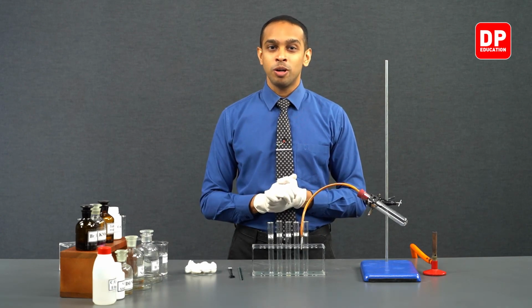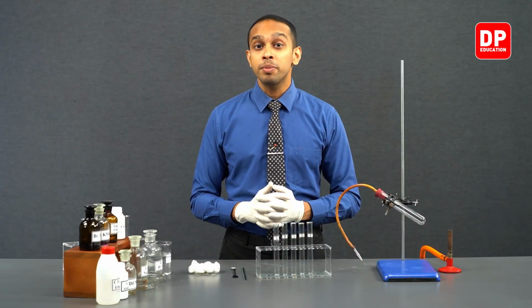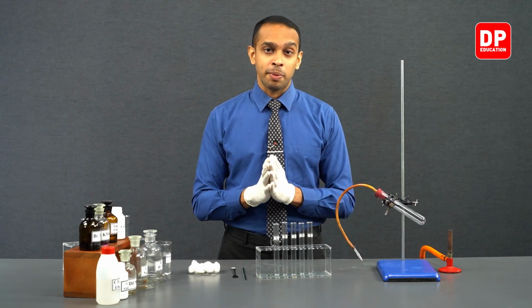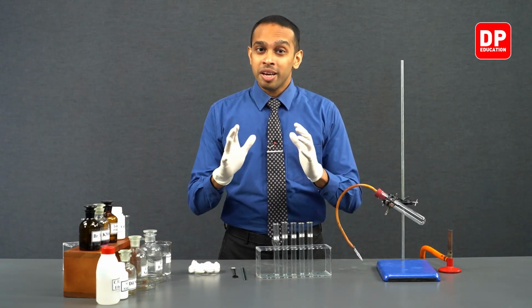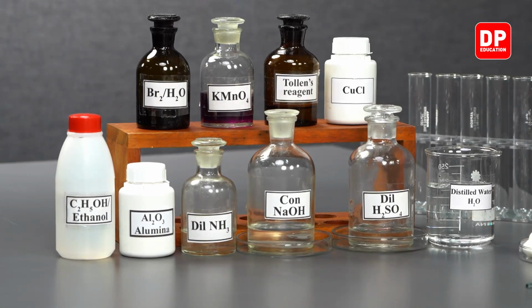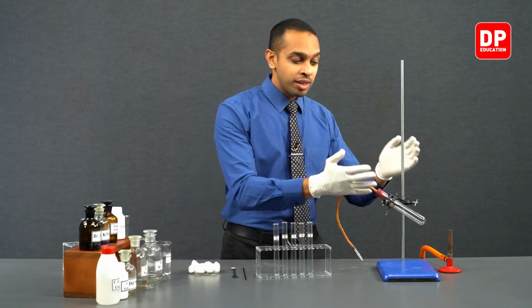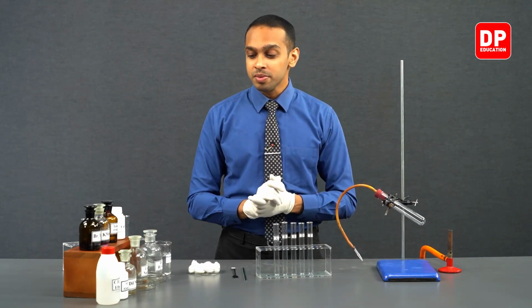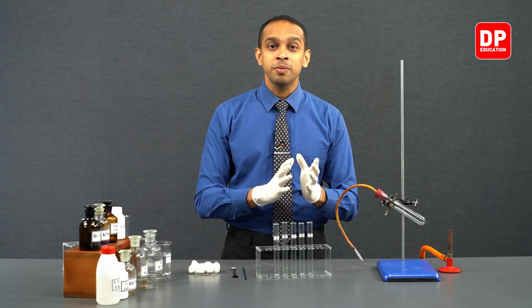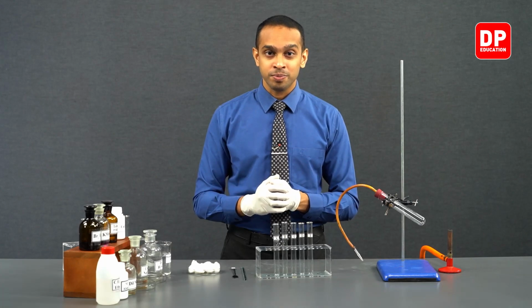Now let's move on to the first part of our experiment. In the first part, we are going to observe how ethene reacts with different reagents. So first of all, we have to produce ethene. To produce ethene, we are going to use this setup. We are going to take ethanol and react it with aluminium oxide, Al2O3, alumina.